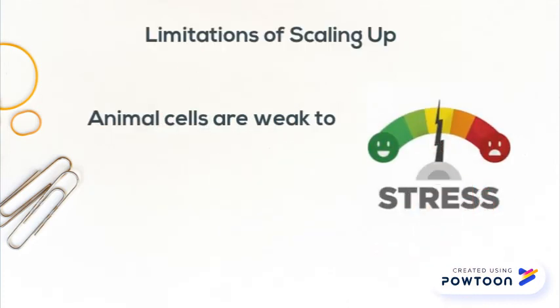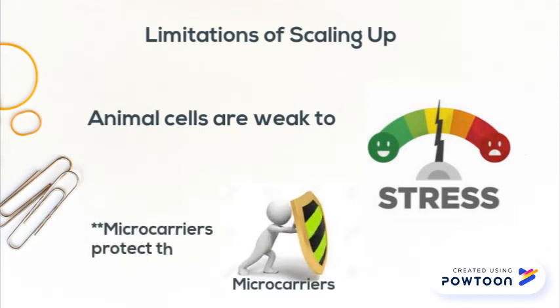In stirred tank bioreactors, cell cultures are typically exposed to physical and chemical stress. By using microcarriers, cells are more protected from shear stresses caused by the tip of the stirrer and sparged oxygen bubbles. Additionally, cells could tolerate chemical stress like lactate buildup when they grow inside the porous carrier.